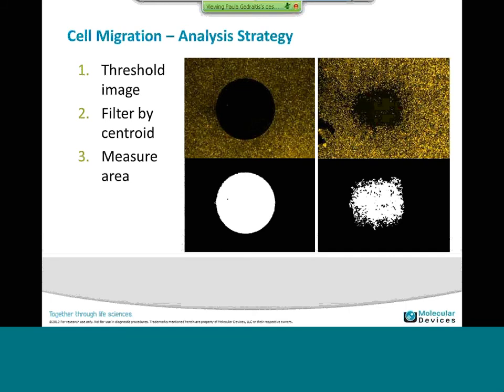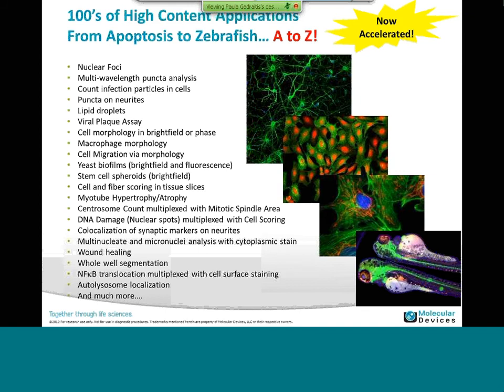I just wanted to show an overall subset of some of the different custom modules that have now been created and are in use, just to give you an idea of the breadth of assays that we can cover with this custom module editor, far more than we can with any canned modules. We're really excited about this because it really allows our users to develop new assays very quickly and get their experiments up and running much more quickly.